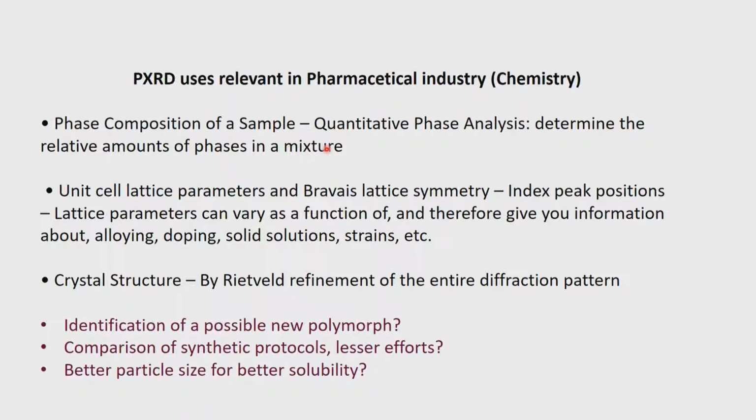So, if you have two different compounds mixed into a system, the two different compounds will give two different types of XRD patterns. By type I mean even the full width at half maximum will be different, the shape of the peak will be different, and so on. So, effectively the profile of the peak which comes in a diffraction experiment is characteristic of the material, and therefore, if we do the analysis of the profile, in principle we should be able to find out the possibility of more than one phase being present in a sample.